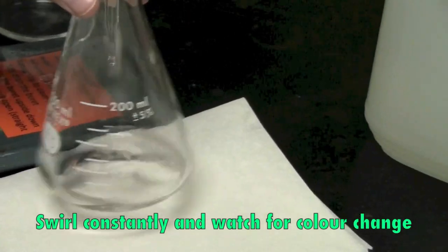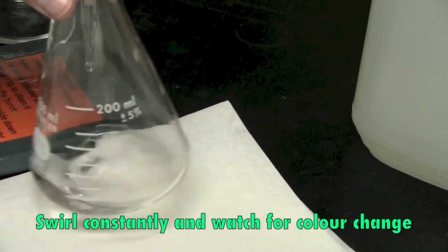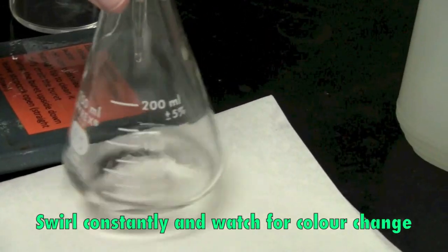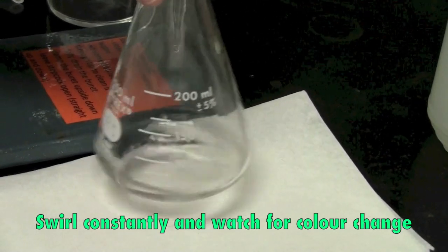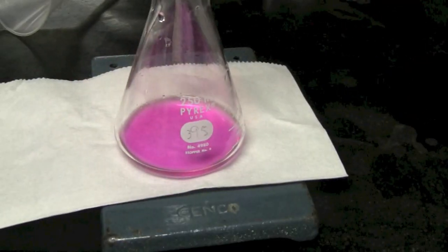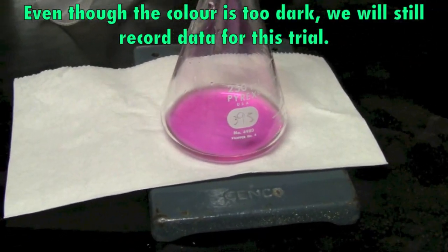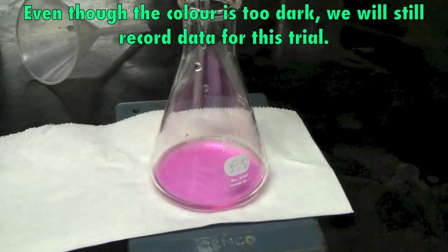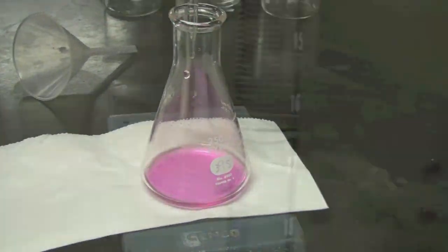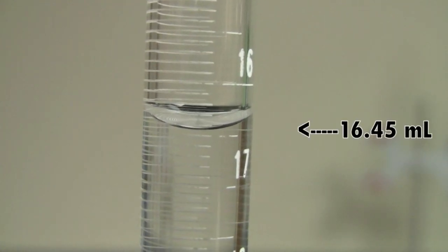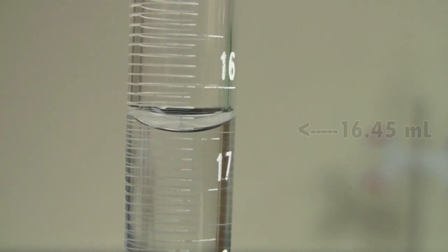And the point of using an indicator is so that we can see that the pH is changing. This is what we call the neutralization. So you can tell this is a very dark pink color. So we're going to set that aside and we're going to take our final burette reading. So it's around give or take 16.45.